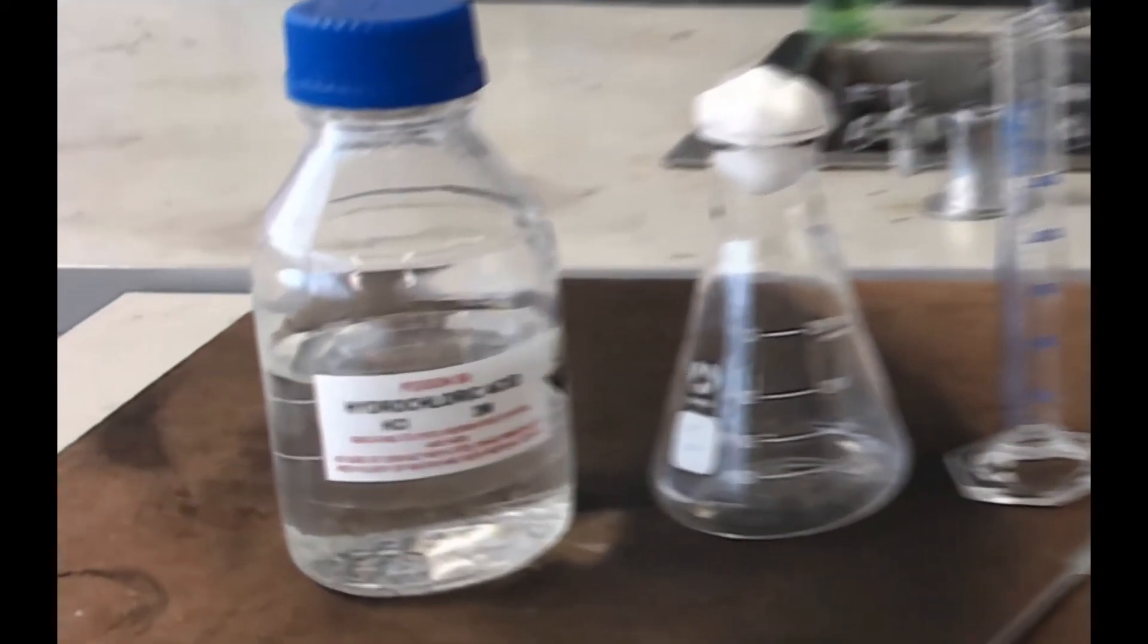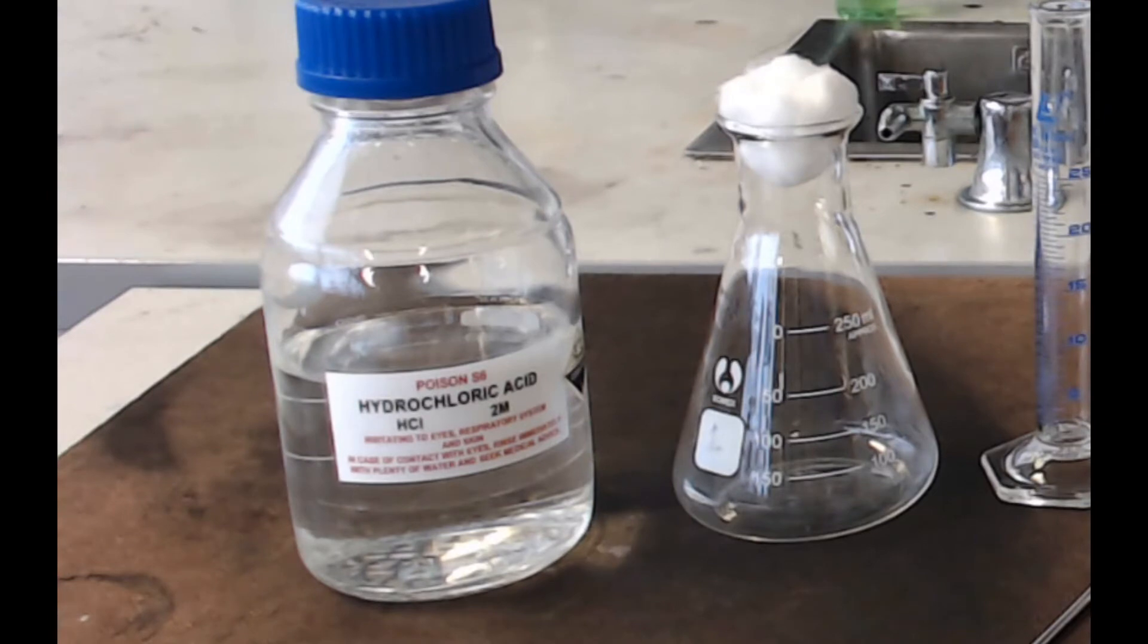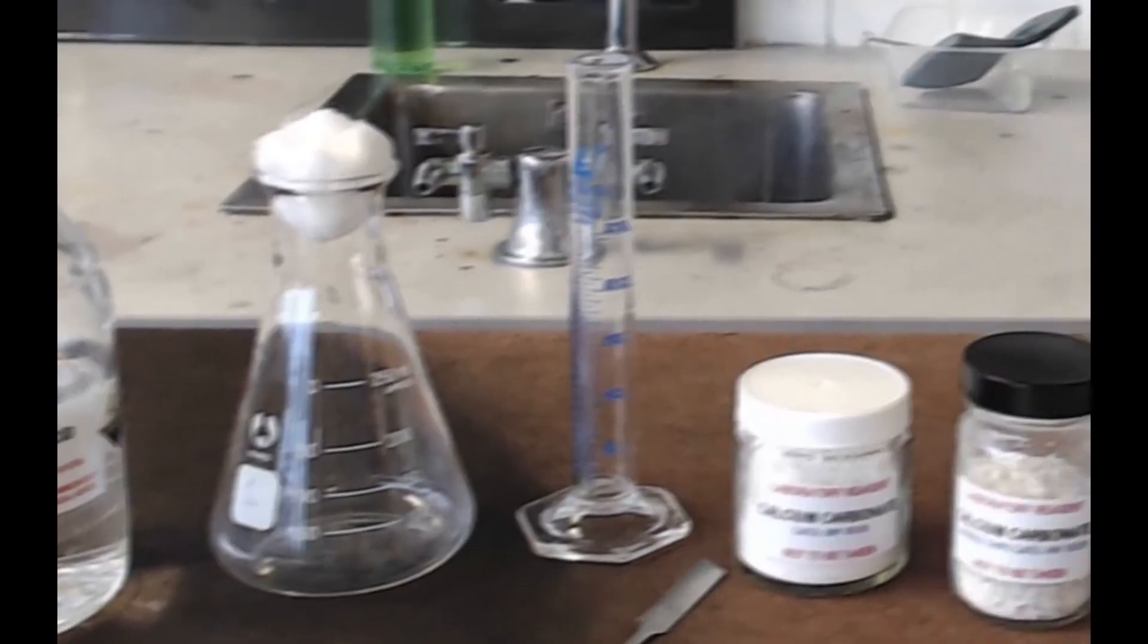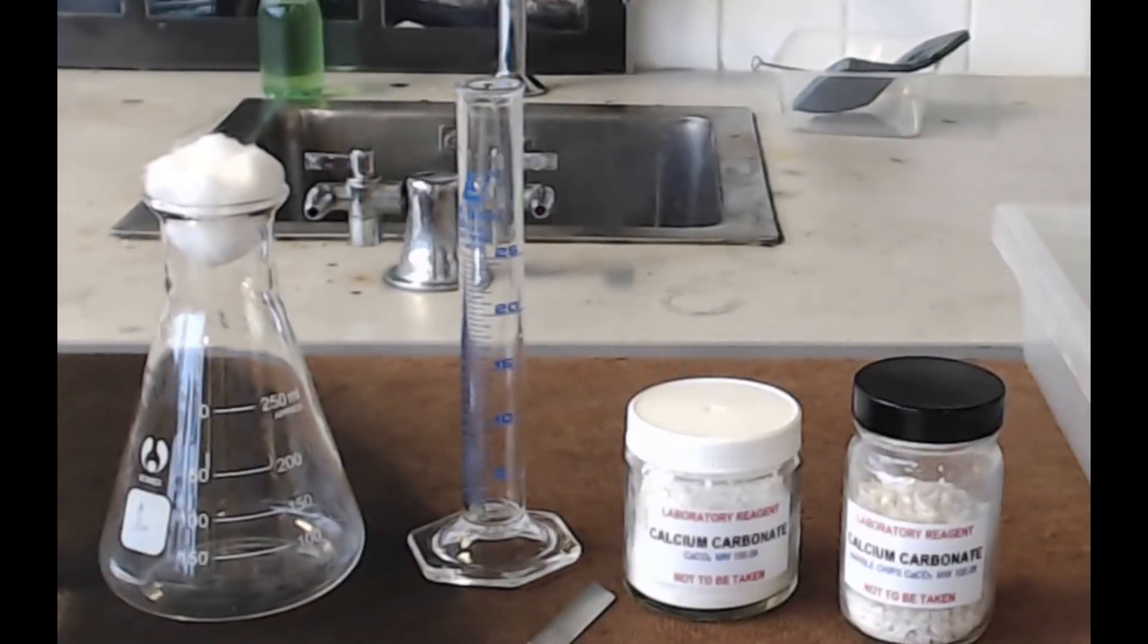You're going to need some 2 molar per liter hydrochloric acid, a conical flask with a cotton wool bud to fit on top, a measuring cylinder - this one's 25ml but you could use any size really.